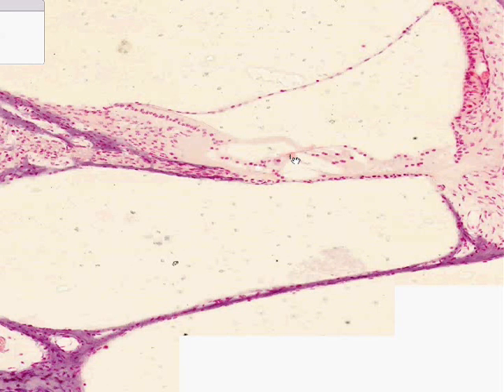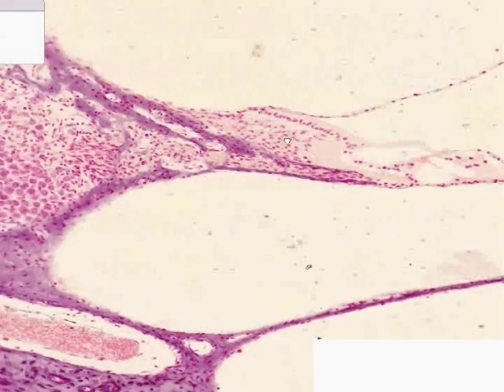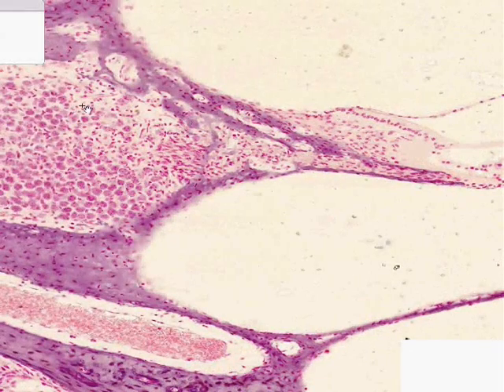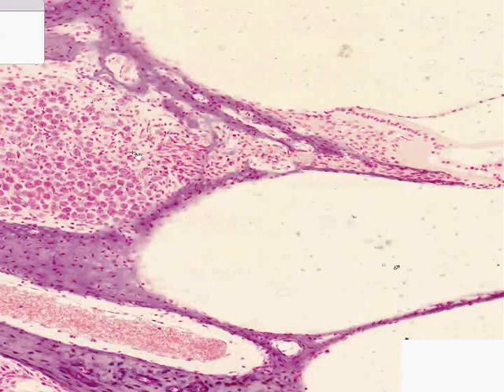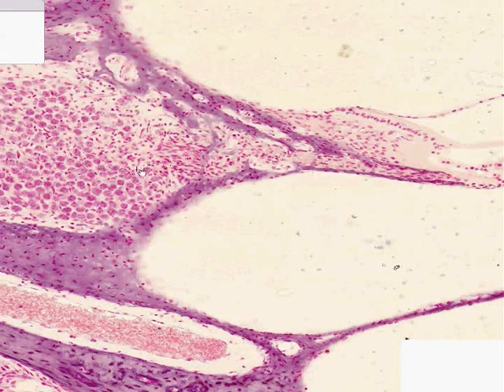You can see very close to the organ of Corti a large ganglion, which is the spiral ganglion, an area of ganglion and some nerves. Everything else here you will recognize classically as being dense bone.